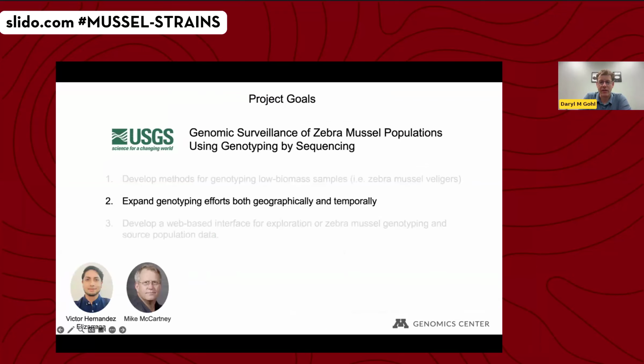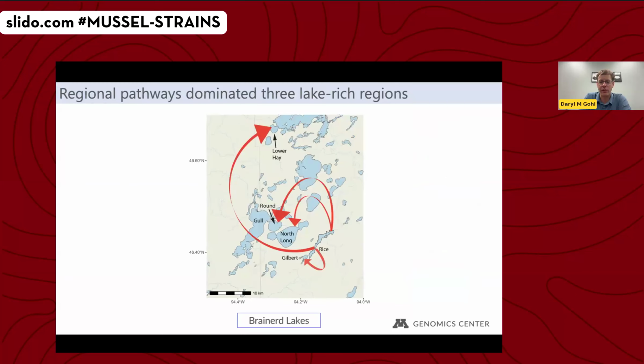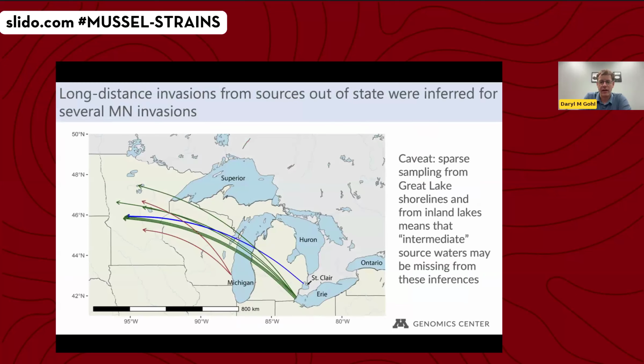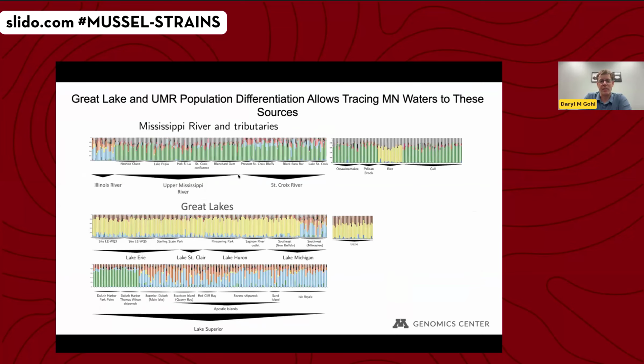So we can basically look at those ancestry plots, which will give you a good sense of the relatedness. Here's the Mississippi River, like I was saying. We have these five or six different sites throughout the Mississippi. You can see that they all look very, very similar to one another. They have this kind of green and gray and red dominated ancestry clusters.